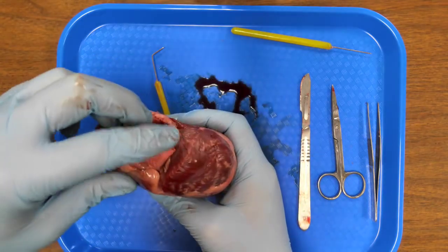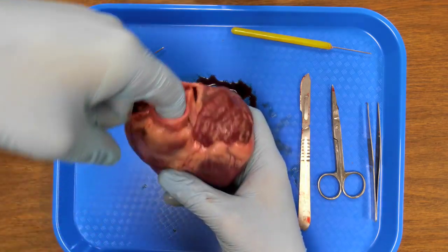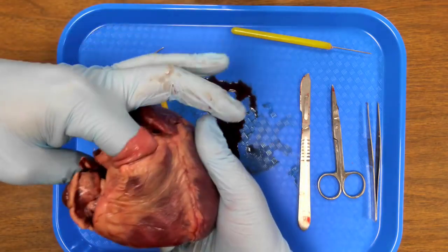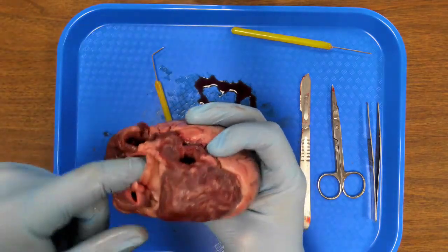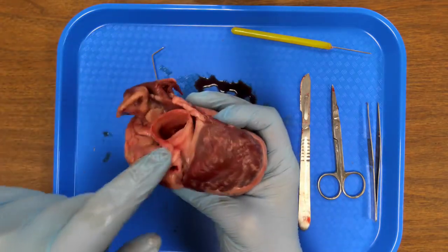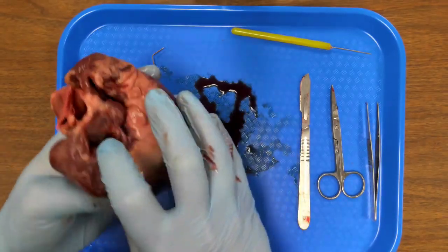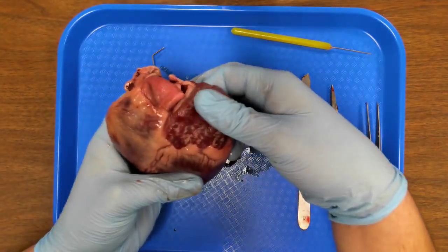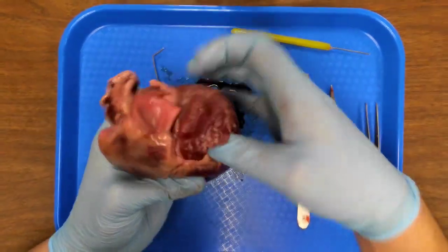We have got, this is the start of the aorta here, I believe. Nope, sorry, that is also part of the vena cava. Here we go. Here's the start of the aorta. Notice it has been cut off. We've got those pulmonary arteries or veins that lead back into the other side of the heart.